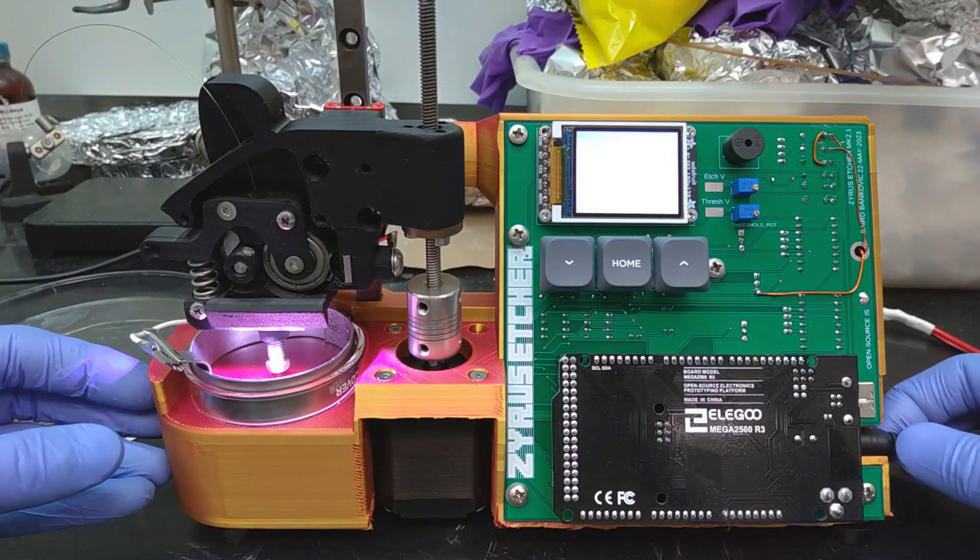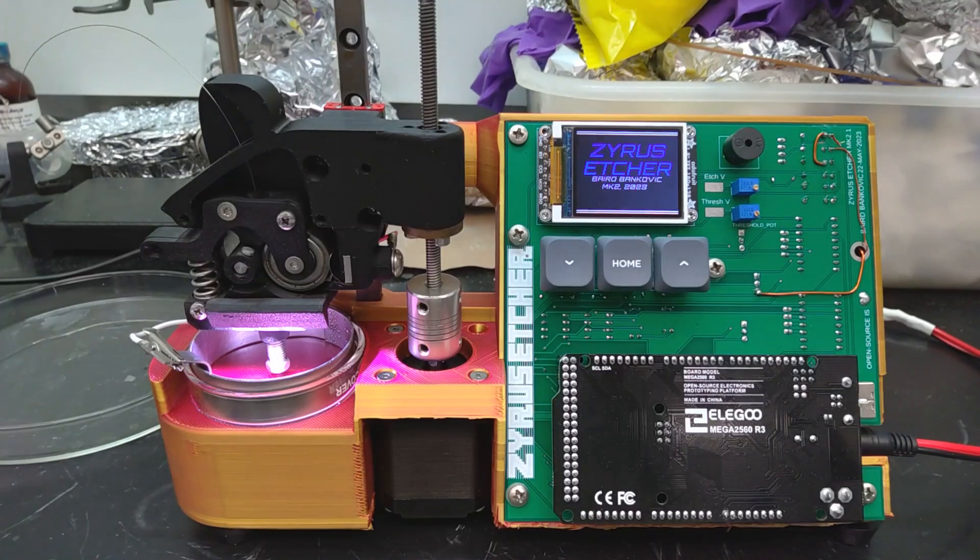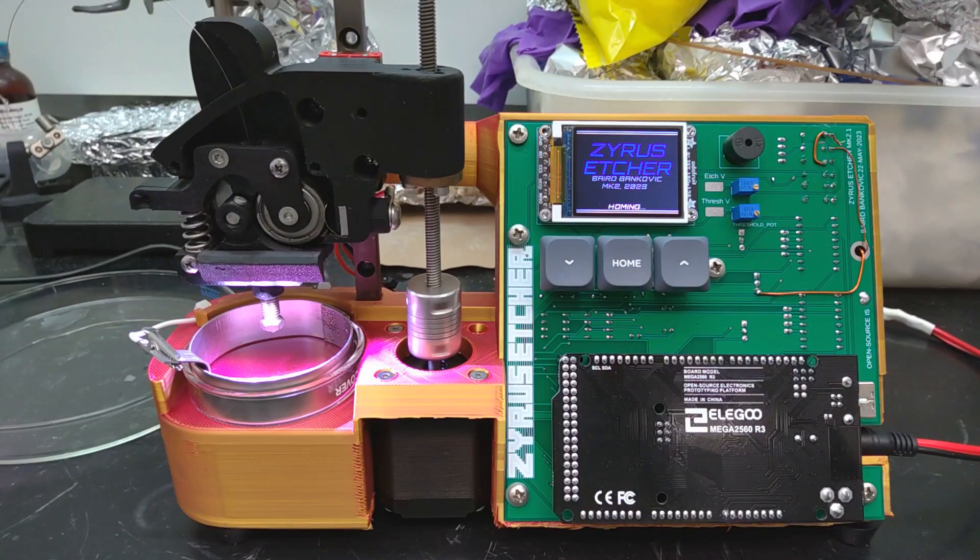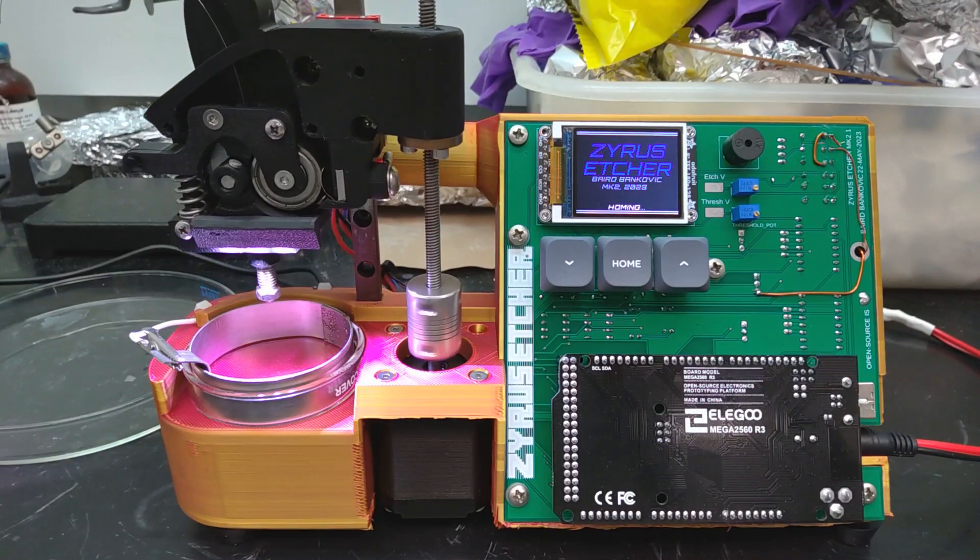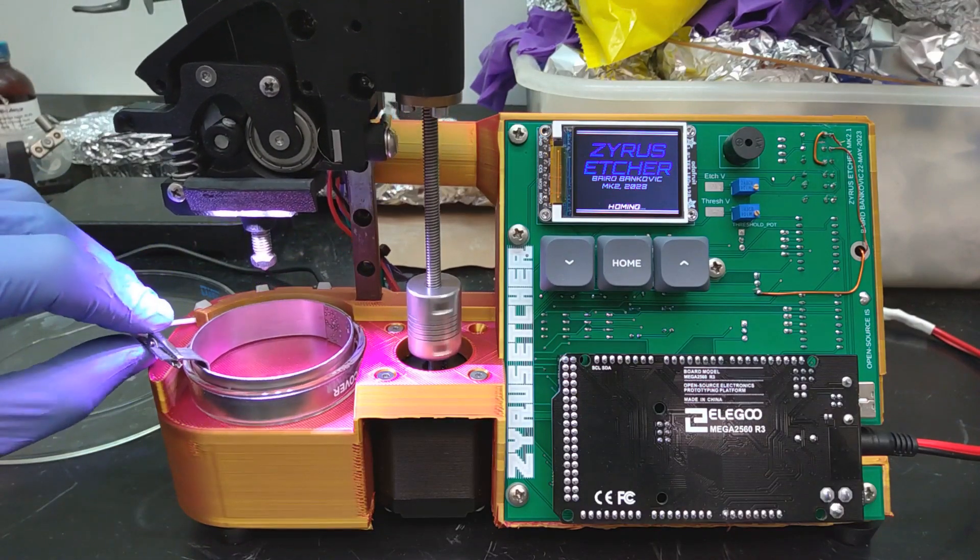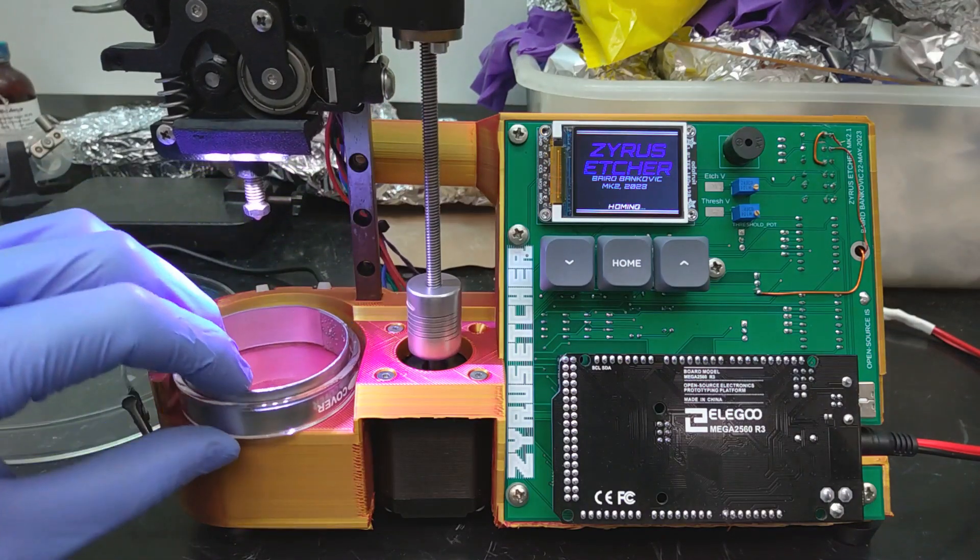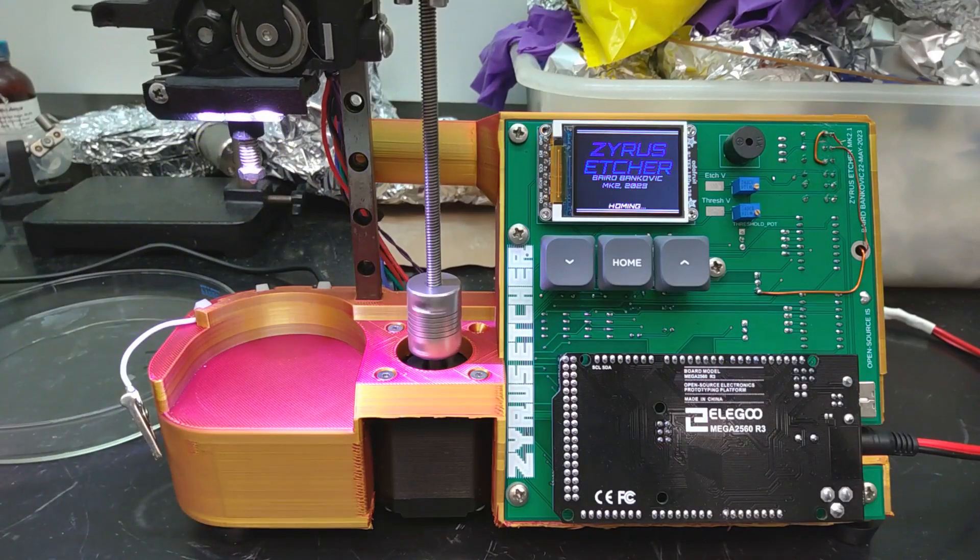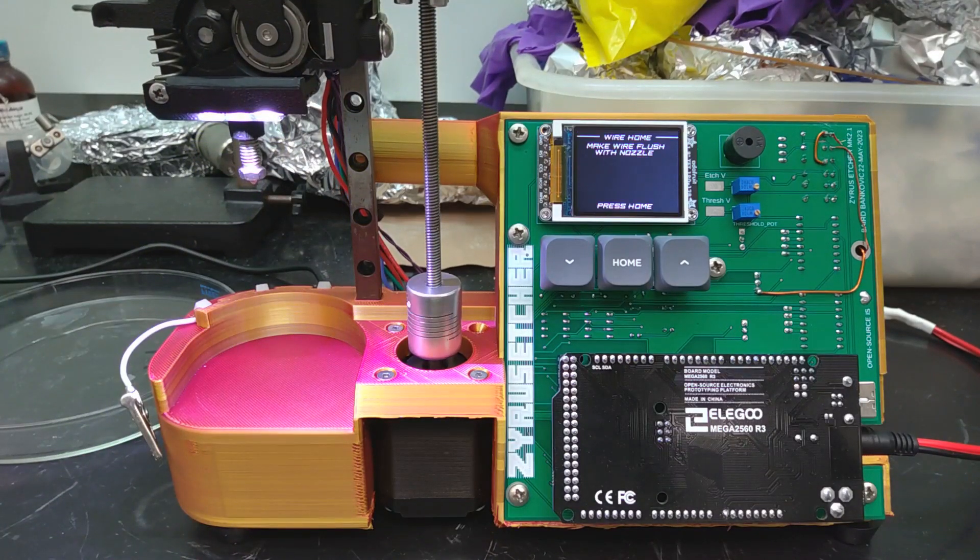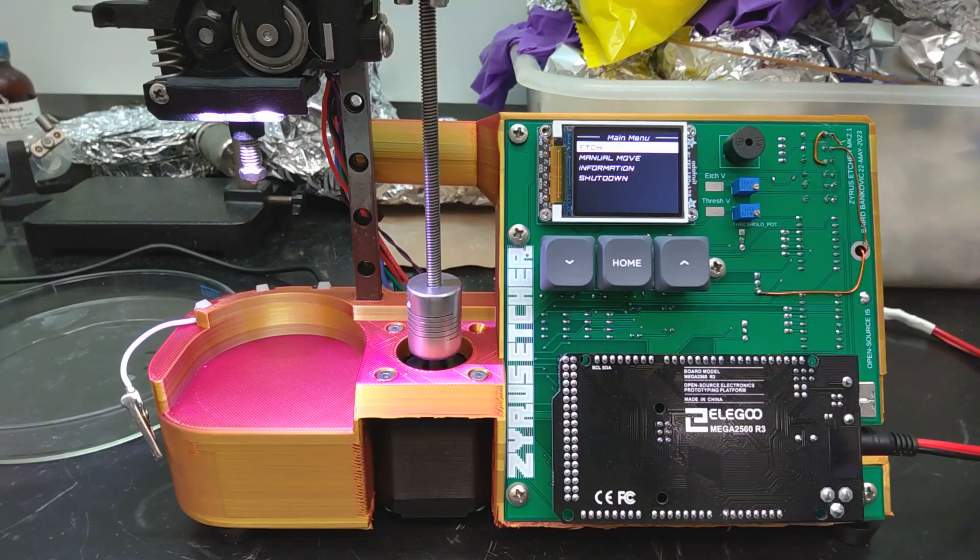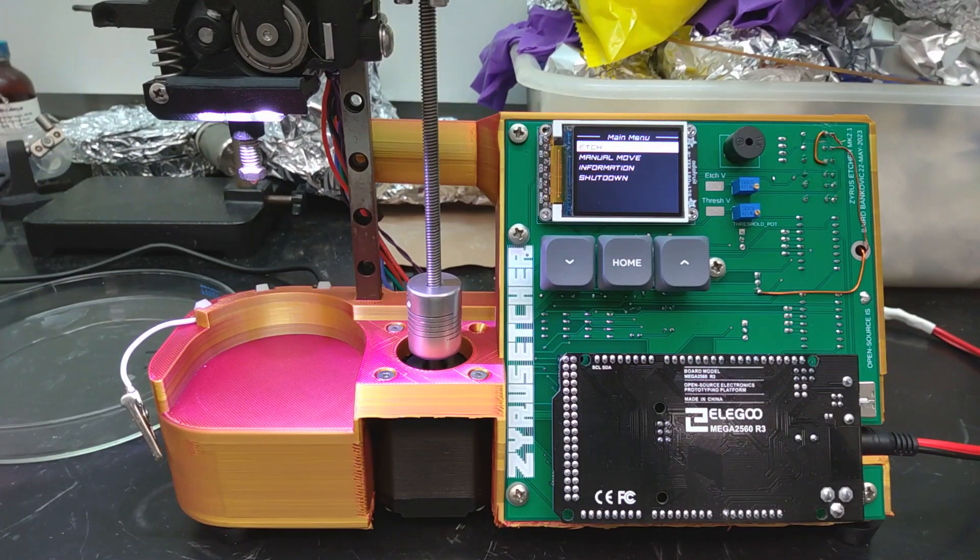This is a demonstration video of a semi-automated tungsten tip etcher for use in STM. The machine has a wire extruder and a z-axis, which allows the wire to locate the surface of the etchant and repeatedly submerge the wire at a specified distance below the liquid, which is important for tip quality and consistency.